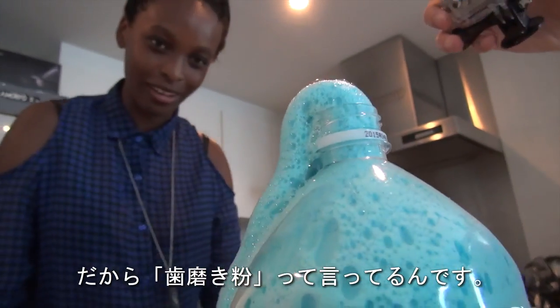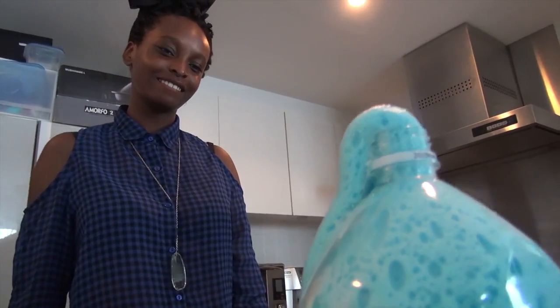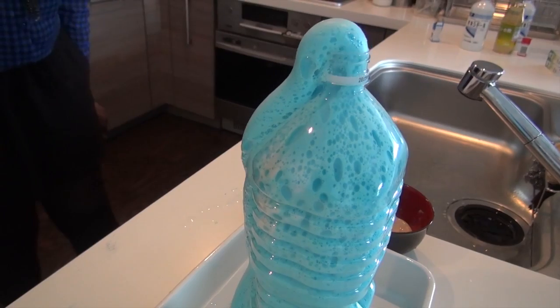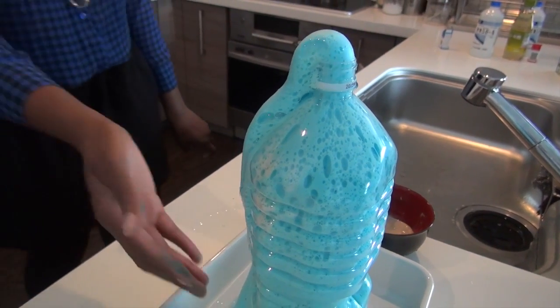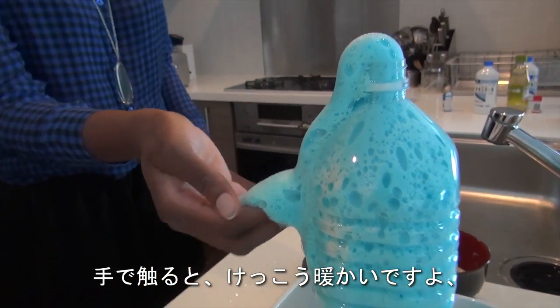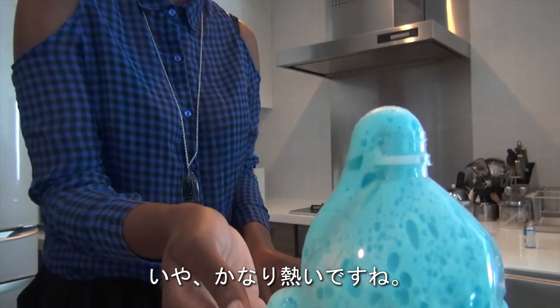That is why we call it elephant toothpaste. If you hold it in your hand, it's warm — not just warm, it's pretty hot actually. It's real.